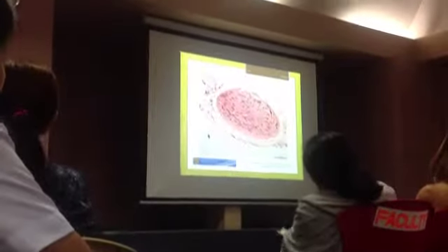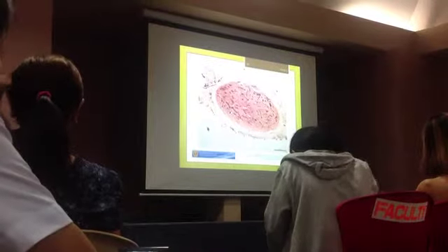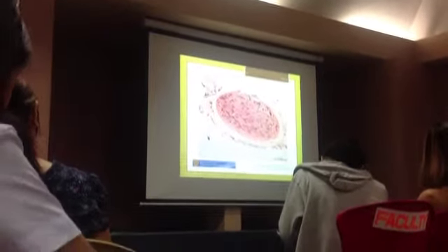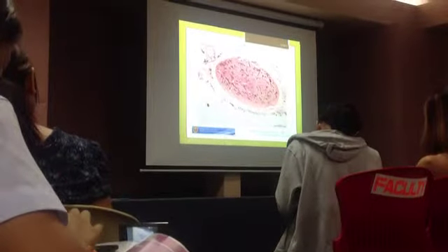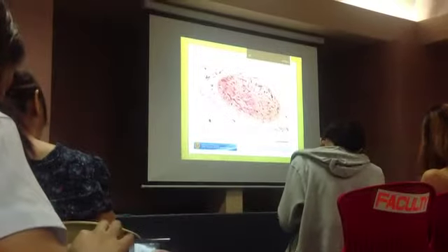In the spinal sympathetic ganglion, you see mixed, different arrangements of the fibers admixed with the cells or neurons.